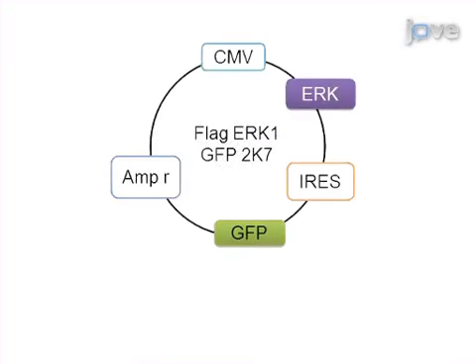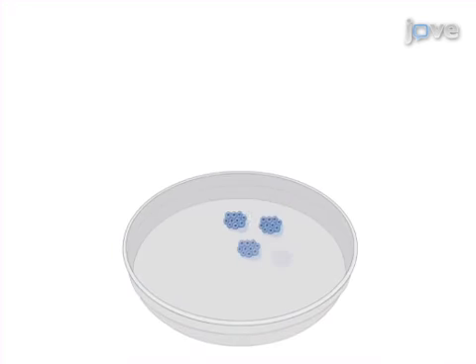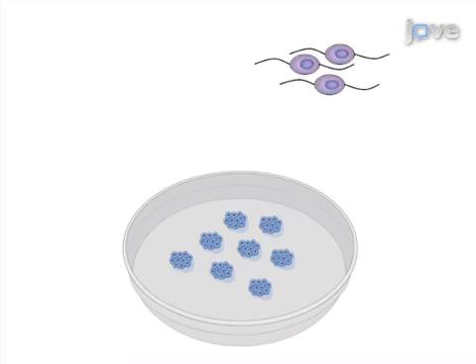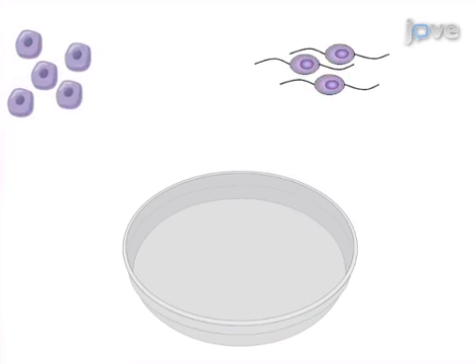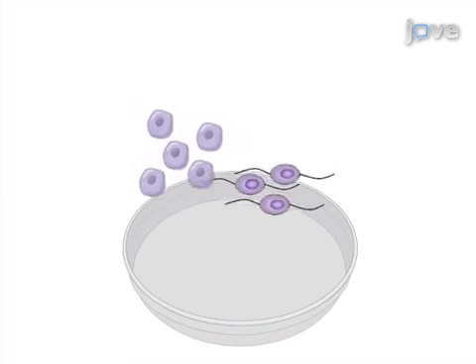The next steps are to produce the lentivirus and determine the optimal viral concentration for the experiment. Following this, dissected and cultured OPCs are transduced with the lentivirus. The final step is to seed the transduced OPCs onto cultured neurons, dissected from the DRG.